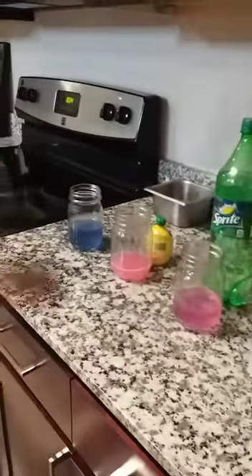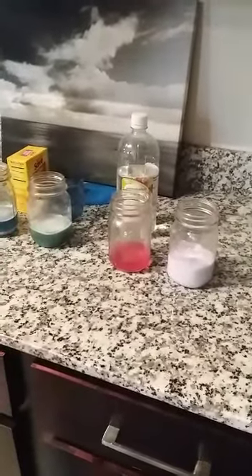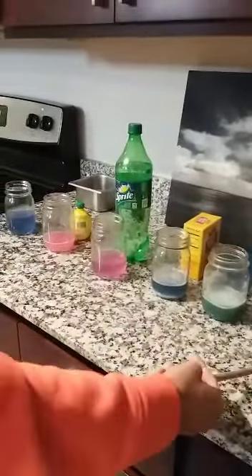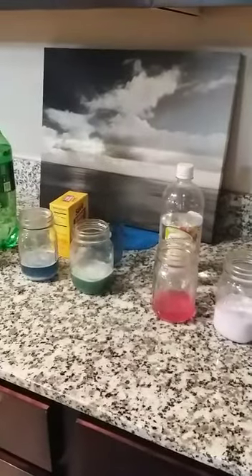Okay, so the colors indicate where this is on the pH scale. 0 is acid and 14 is base. So for this purplish color, I feel like it's a little bit more on the neutral side. That's what I think personally. I wouldn't be able to tell you specifically. For the red, since it's down here, I would say vinegar. It's very acidic. I'd give it maybe a 2.